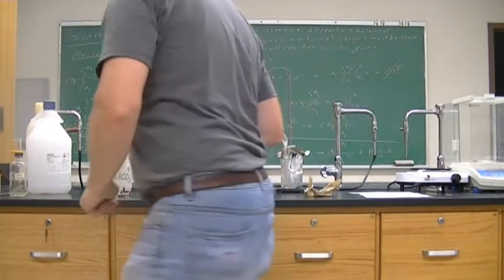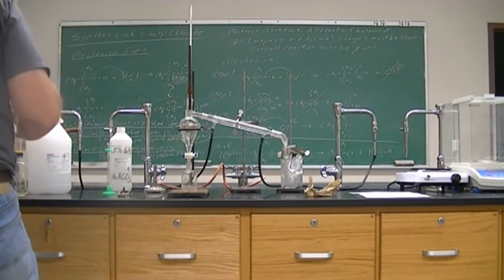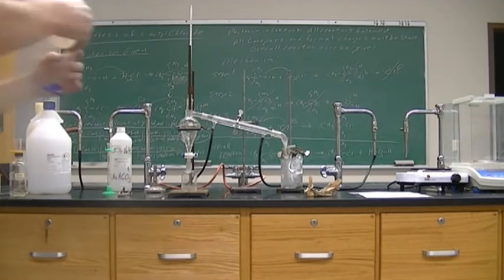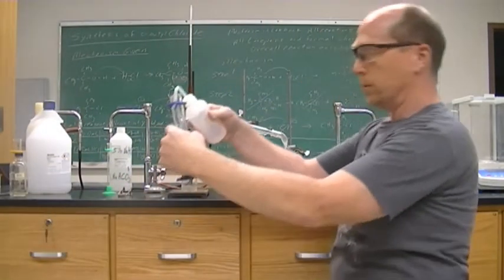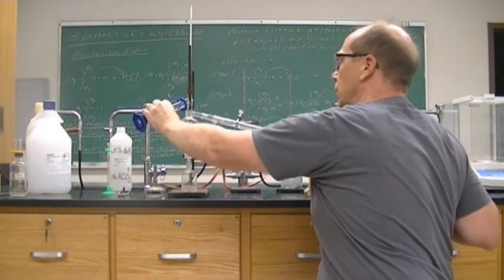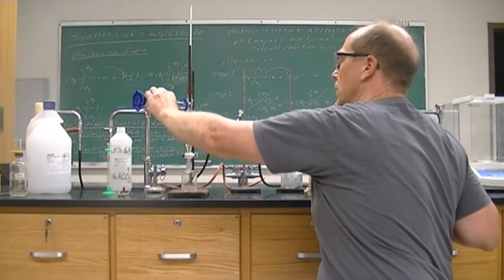You have your graduated cylinder. And it really doesn't matter. I'll measure it, but there is no need to measure it. All right, so 10 mils, it doesn't matter. It's just washing the product.